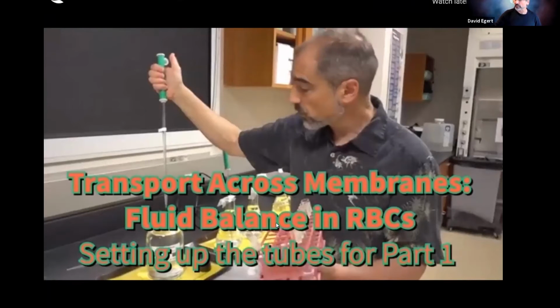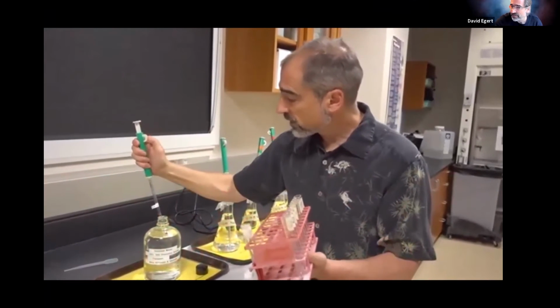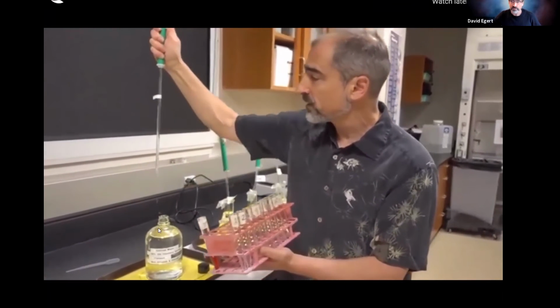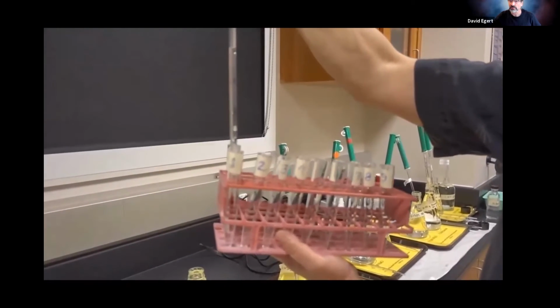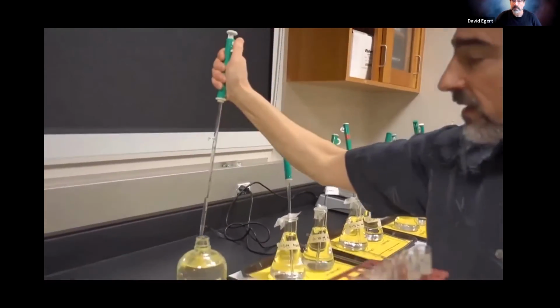Transport across membranes, fluid balance in RBCs, setting up the tubes for part 1, starring me. Yeah, this is always kind of embarrassing. With 3 mils of distilled water in test tube 1. Again, we've already discussed the proper use of these pipettes. I've sucked up to the 0 here, putting it in the appropriate test tube. Now I dispense down to the 1 mils dispensed, 2 mils dispensed, 3 mils dispensed, and that's that.